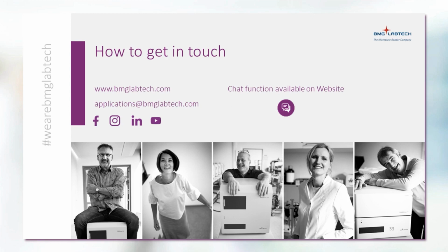What I would also like to mention here is, of course, the EDR feature that is available on the Vantastar and the Clariostar, the enhanced dynamic range, which automatically adjusts the gain value over the whole measurement time. So in these cases, you don't even need to worry about the gain. It will be adjusted and controlled by the reader.